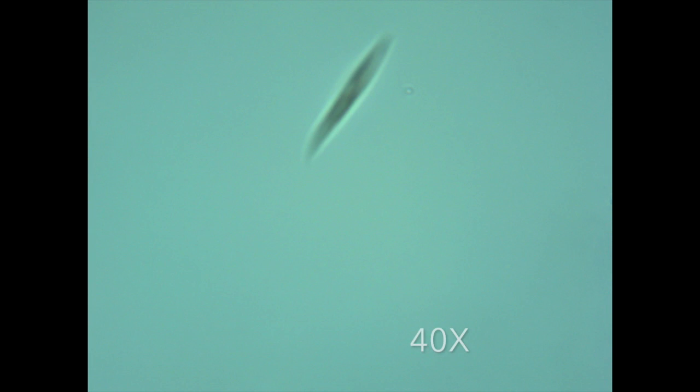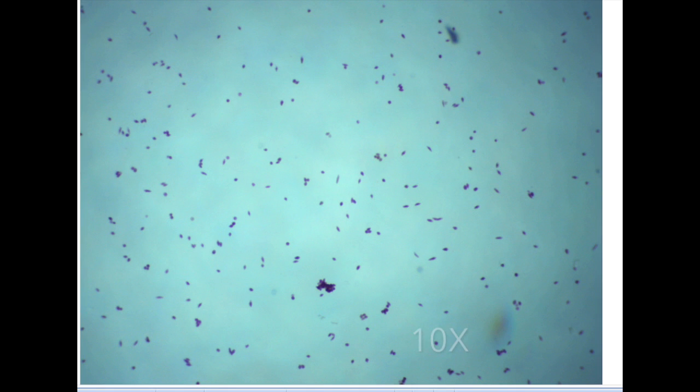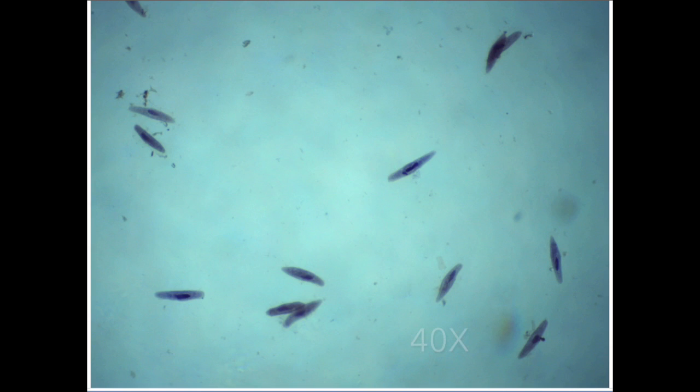After putting the slide under the microscope, I waited about 5 minutes and observed the euglena again. At this point, most of the euglena had very slim to no movement. When this says preserved euglena, it means the euglena was not alive at the time this picture was taken. In the 10 magnification of the euglena, you cannot see much about the euglena. In my opinion, the 40 magnification preserved slide euglena shows more parts of the euglena.